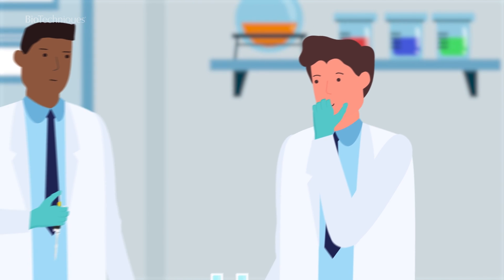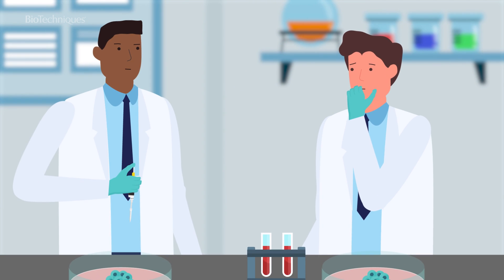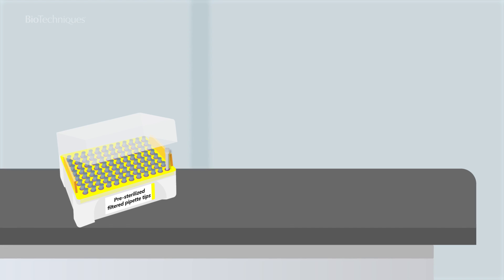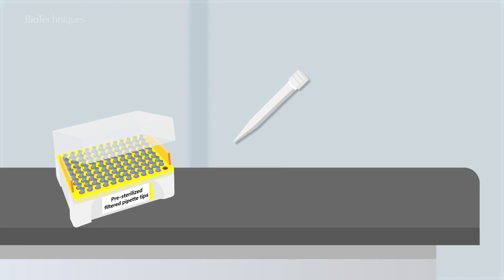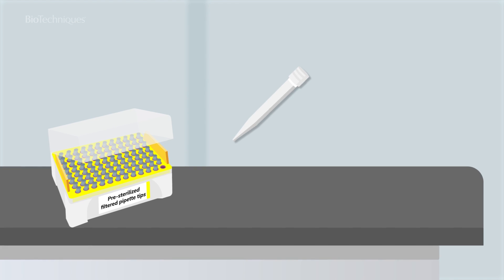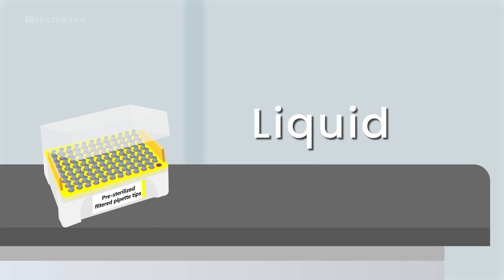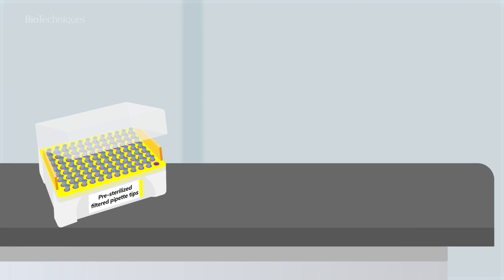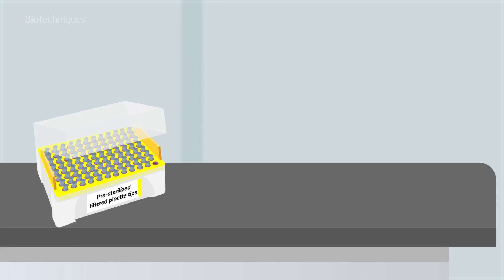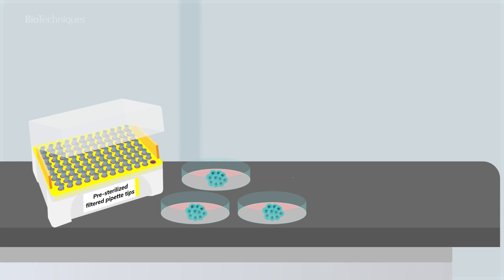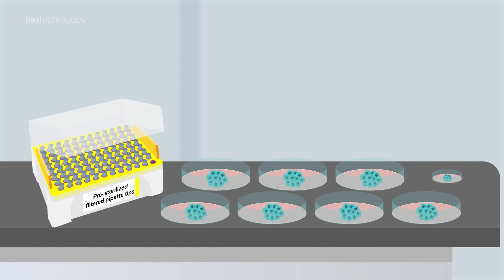Contamination can also impact reproducibility. Pre-sterilised filter tips should be used in cell culture applications, as the filters reduce the risk of cross-contamination. Filter tips can prevent both liquid and aerosol spreading contaminations from reaching the pipette or your sample. Limiting contamination will help make your 3D cell cultures more reproducible.